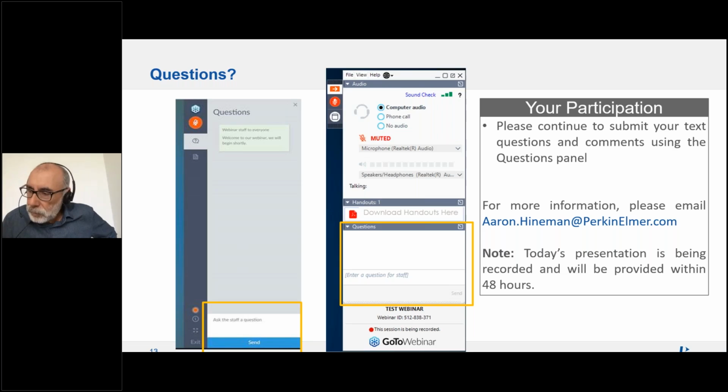Okay, great. Thank you. And I did say that was the last question, but we just got a few more. So thank you again for everyone participating. Next question is, were there any 3 to 5 micrometer plastics that accumulated in the capillary tubing?